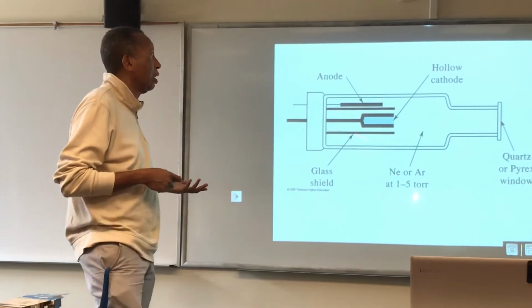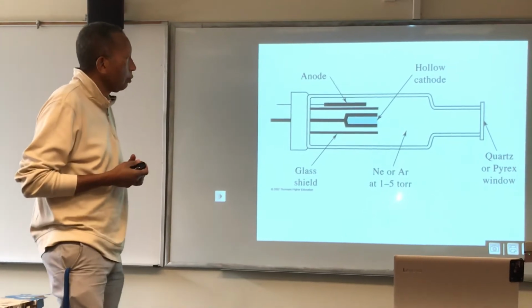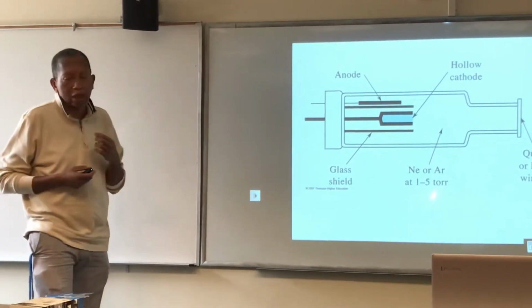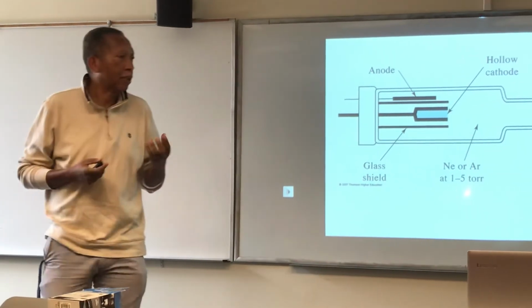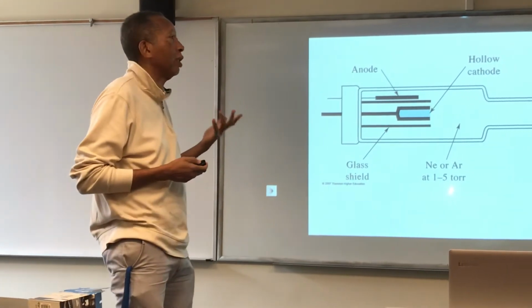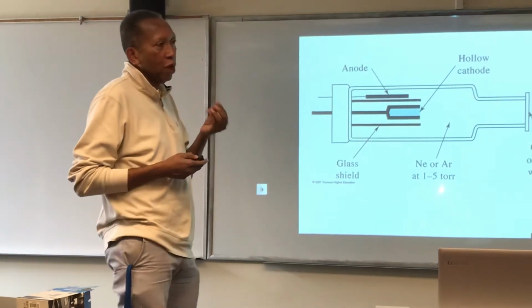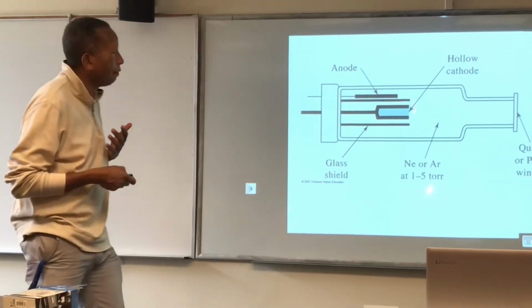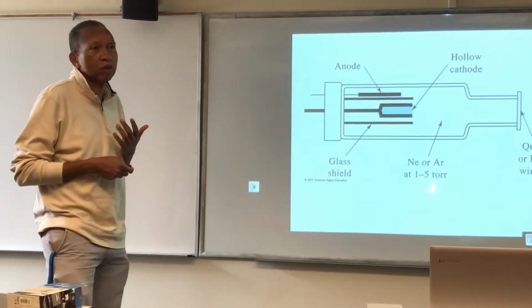And that's why we cannot use a monochromator. In molecular spectroscopy, we use a monochromator to select a narrow band of radiation. But a monochromator does not give us a narrow enough bandwidth. So we have to actually use the metal of interest.